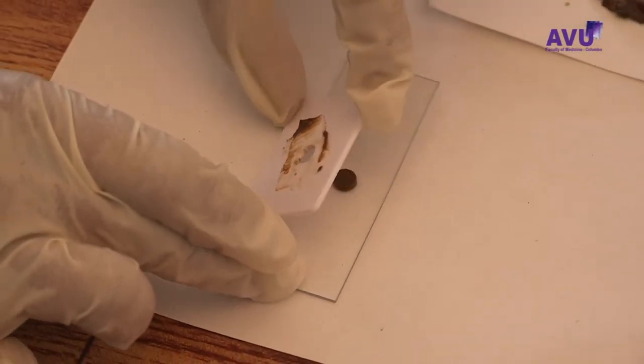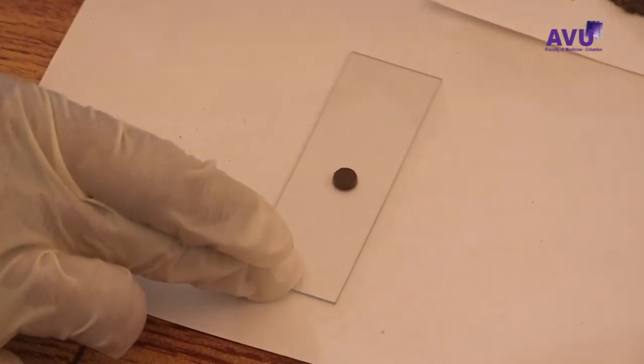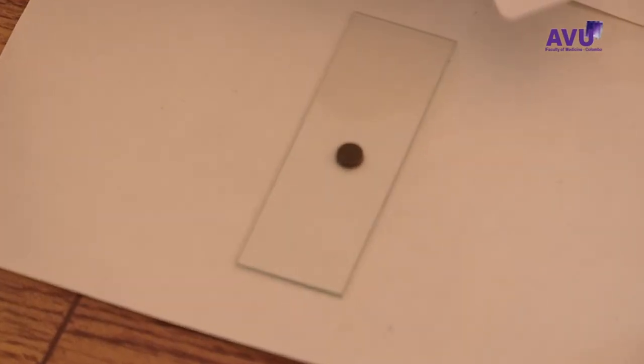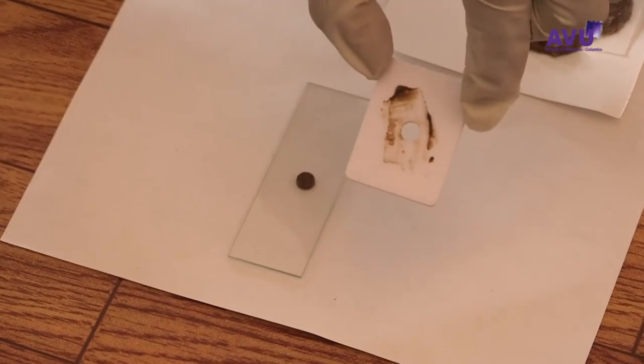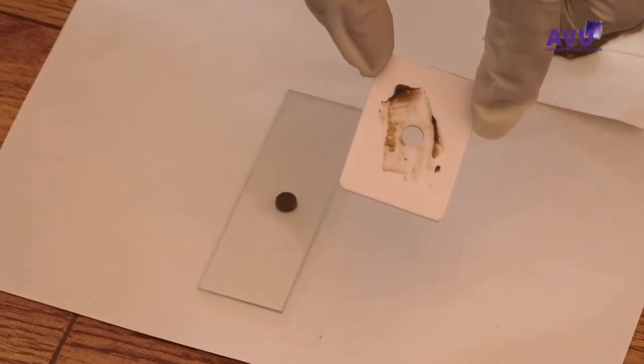Remove the template carefully so that the cylinder of faecal material is left completely on the slide and none is left sticking to the template.